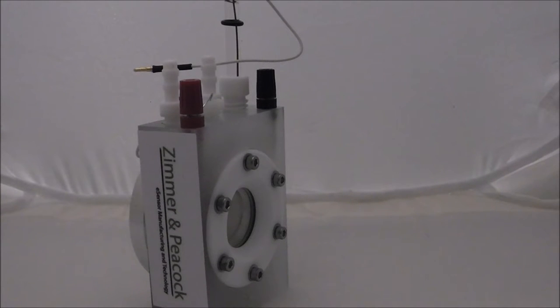Welcome to the PEC2 cell from Zahna. This is an electrochemical cell that allows photo-electrochemistry and electrochemistry experiments to take place at the same time.